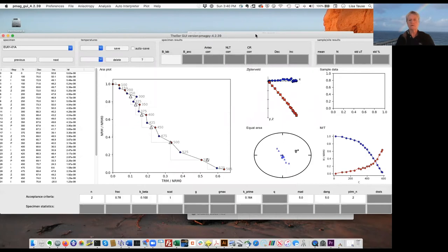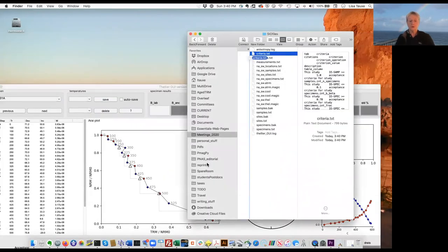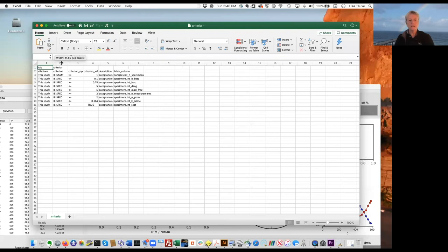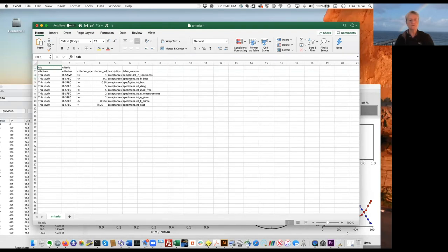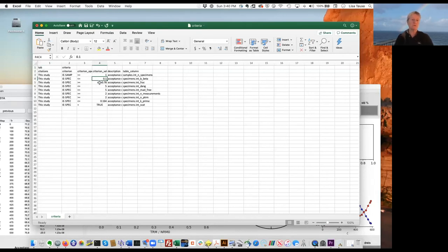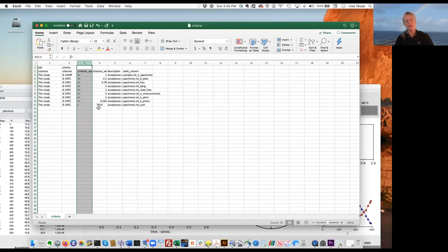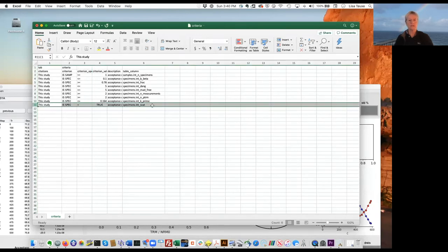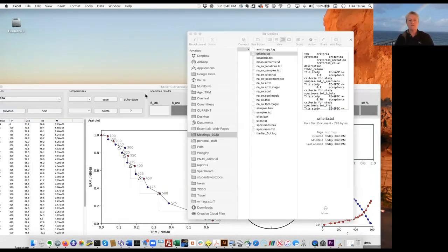Saving that creates a criteria file. We can look at it: beta has to be less than or equal to 0.1, frac has to be greater than or equal to 0.78, and the scat criterion is set to true. These are the criterion values — whether greater than, less than, or equal to — and the statistic being used.